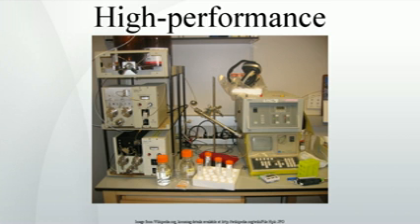This partitioning process is similar to that which occurs during a liquid-liquid extraction but is continuous, not stepwise. In this example, using a water acetonitrile gradient, more hydrophobic components will elute, come off the column, late, once the mobile phase gets more concentrated in acetonitrile, that is in a mobile phase of higher eluting strength.